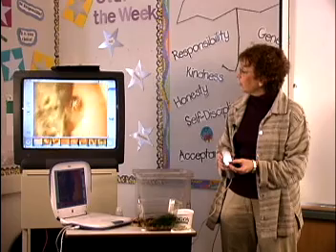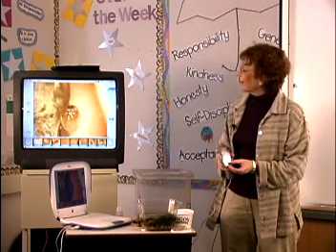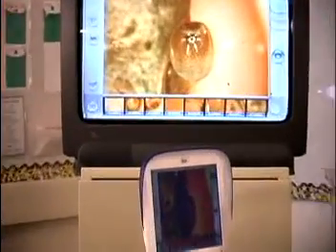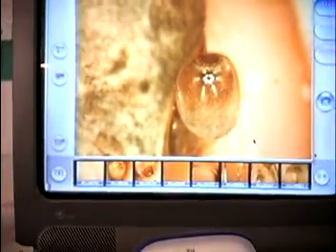Where are you? There you are. And you can see those lights from the microscope being reflected in his eye, right back at us. Teach them to look for details and to relate the details to another person, both orally and in writing.